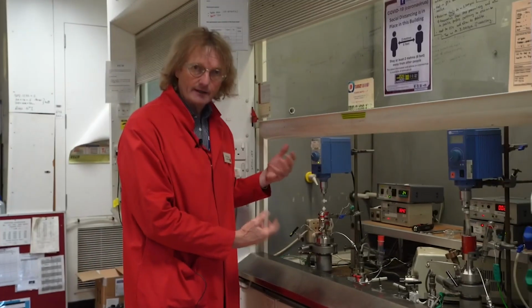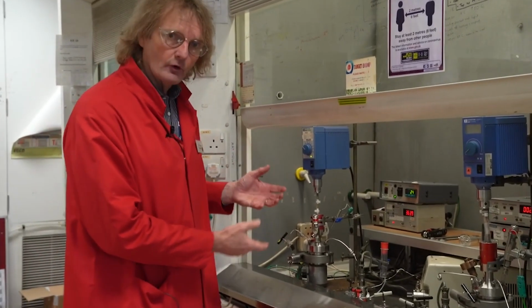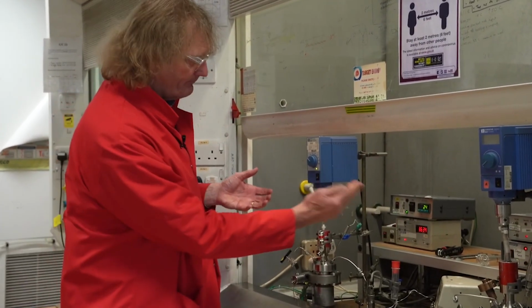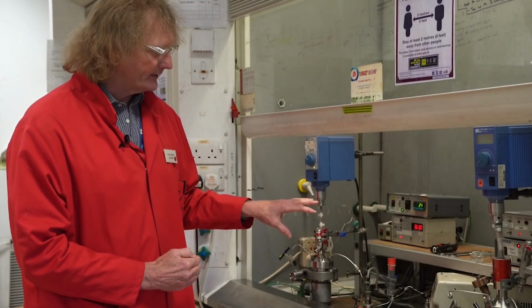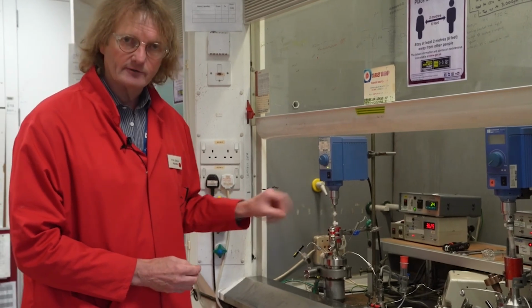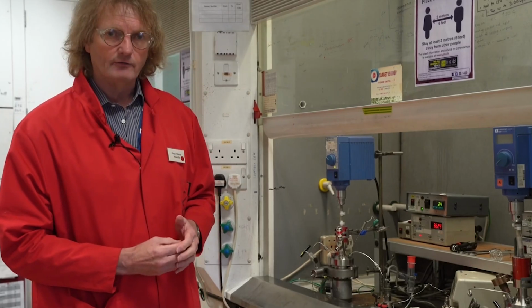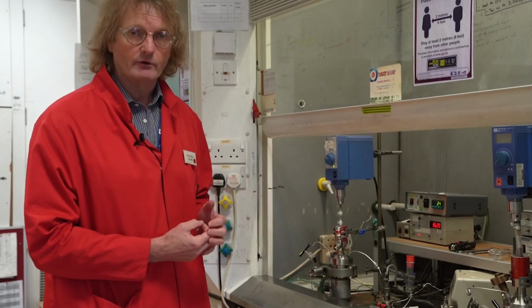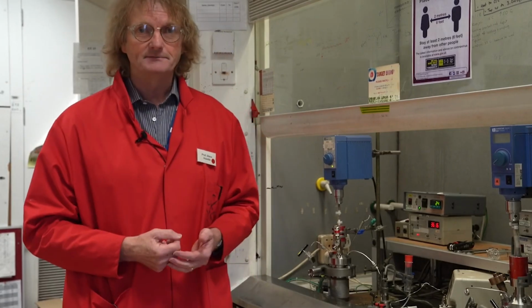And what we've got now is one that we prepared earlier, just like they do on TV with the baking shows. This one has been running for 4 hours, and we've just turned off the heating. It's coming back down from 65 degrees C. The pressure is coming down, and we're going to just monitor this. When it gets to around room temperature, which we're not too far off, we're then going to open up this vessel and look inside and see what we've created. At that point, I'll now hand back over to Kartini.